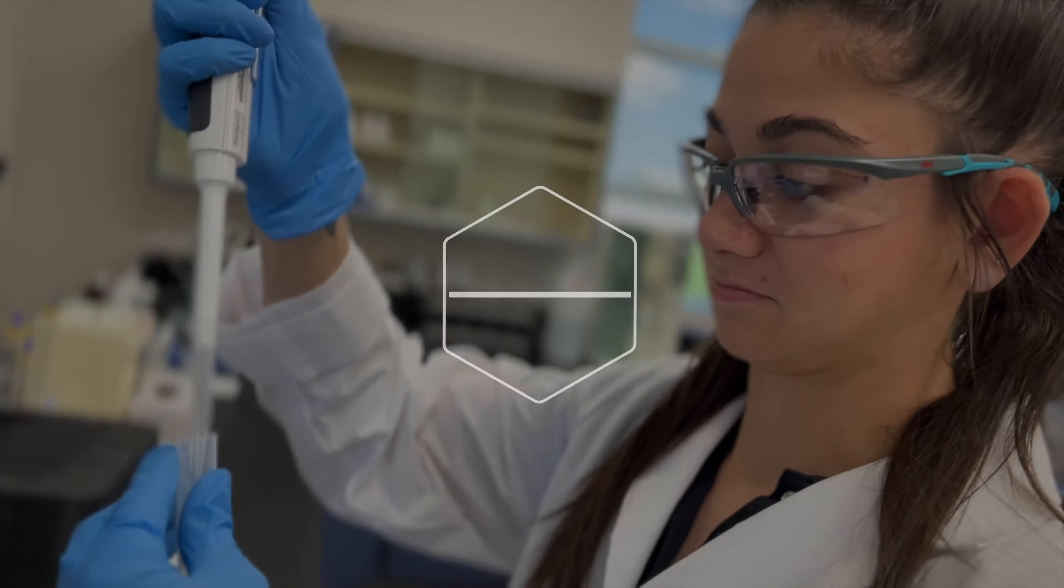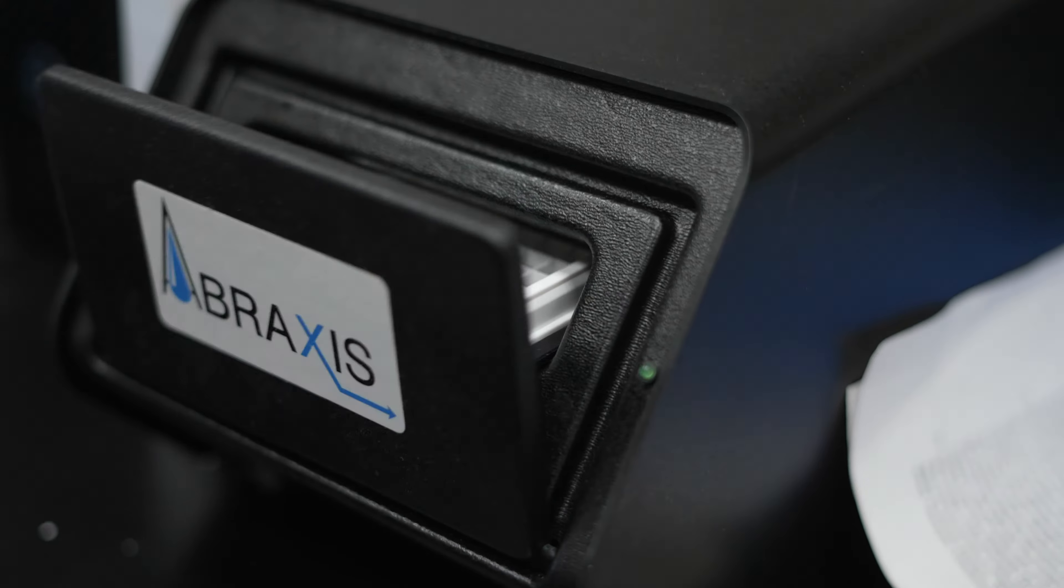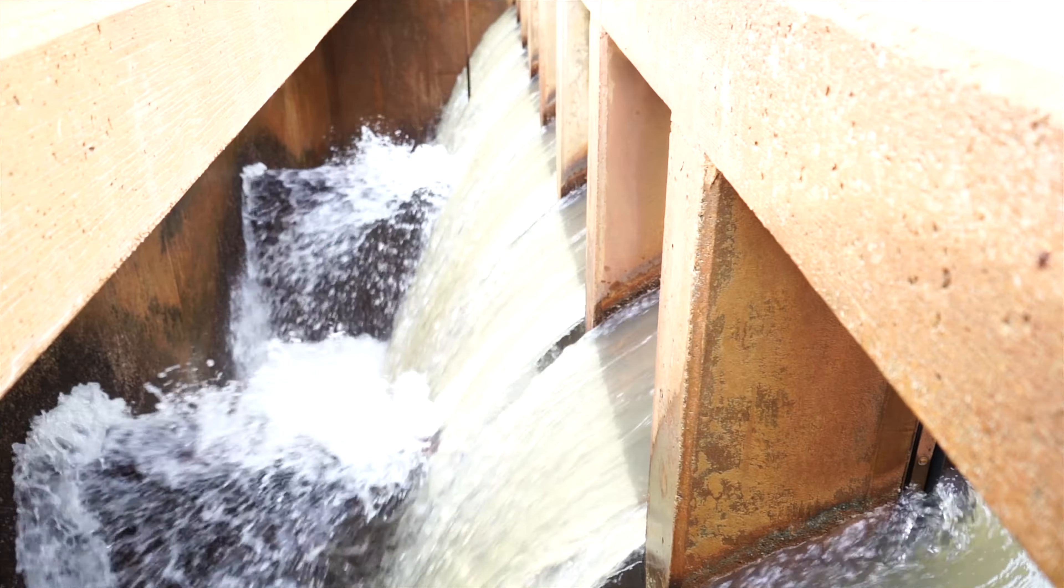The laboratory at Beaver Water District has a few different functions. First and foremost is the protection of public health.